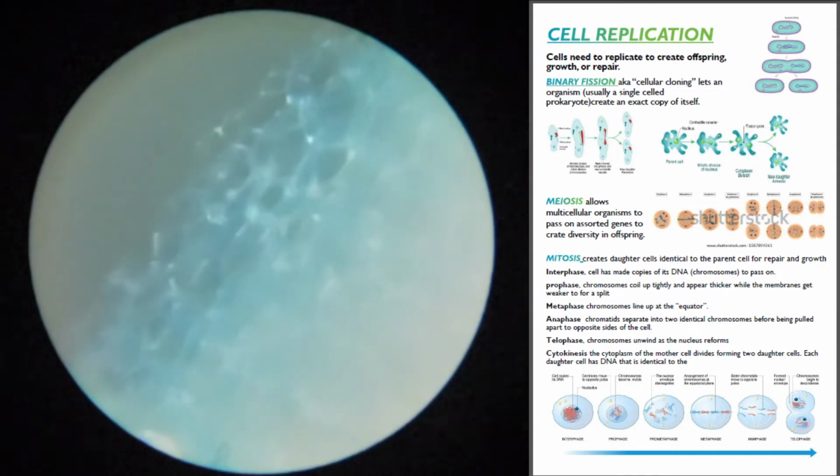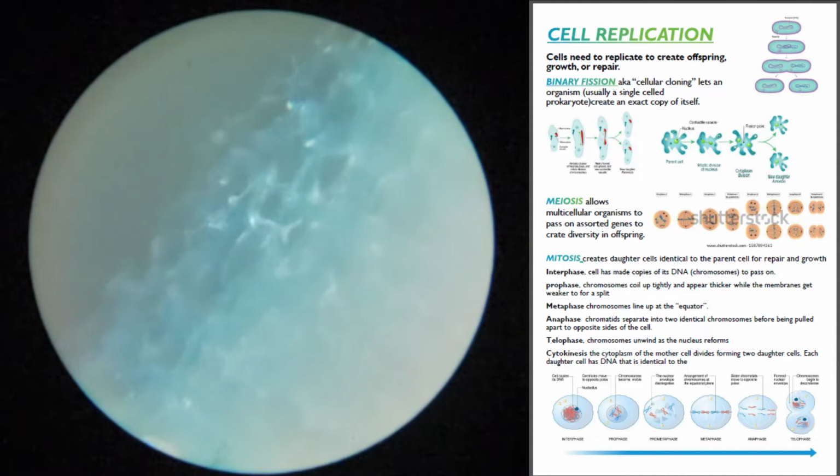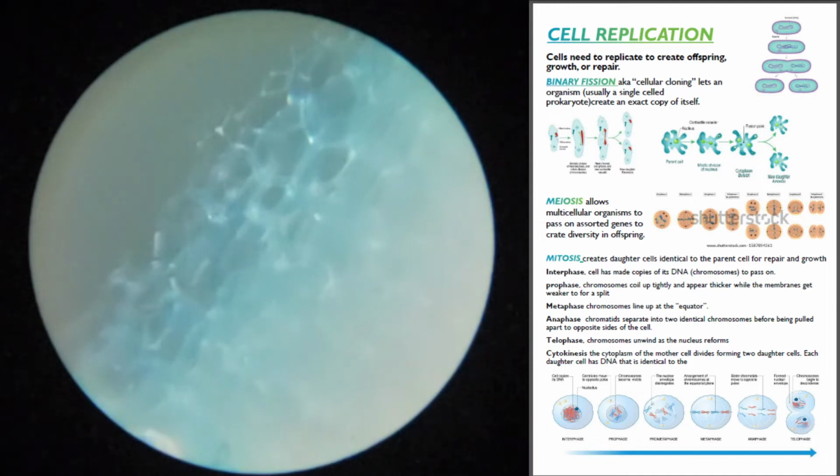So I can see the shredded cells. This was minced onion. So there's a shredder destroying it. No nucleus, no nothing. All I see is the outer wrapper. All through here. Wrappers, wrappers, wrappers. Okay, gone.